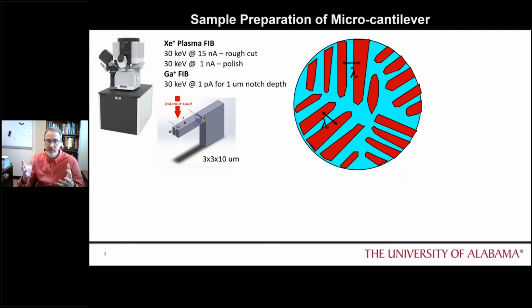Those effects, the icing, will then eventually be removed from your sample. But in our case, we wanted to look at the mechanical behaviors, and we just noticed that the icing was clearly just on the surface as well as on the indenter itself. And so let me start this. And this has been sped up as well, just to speed up time.